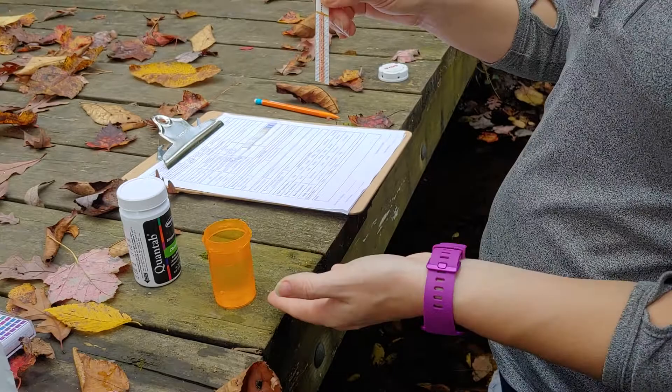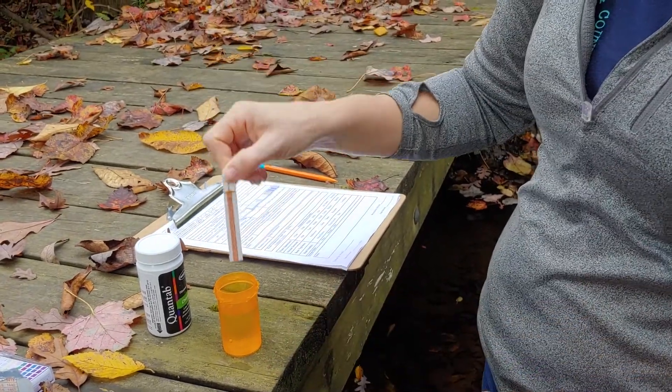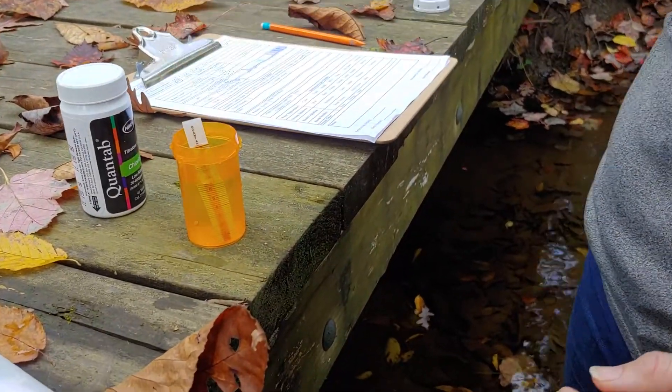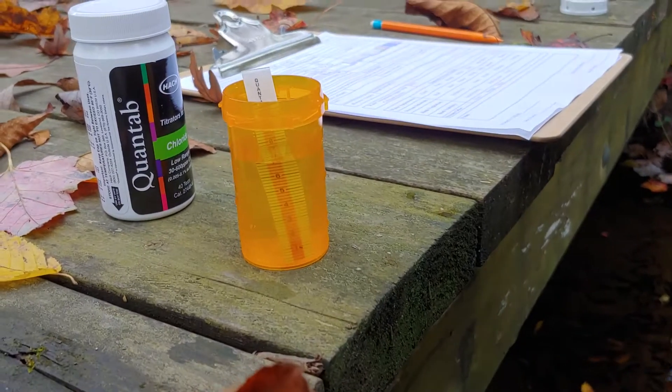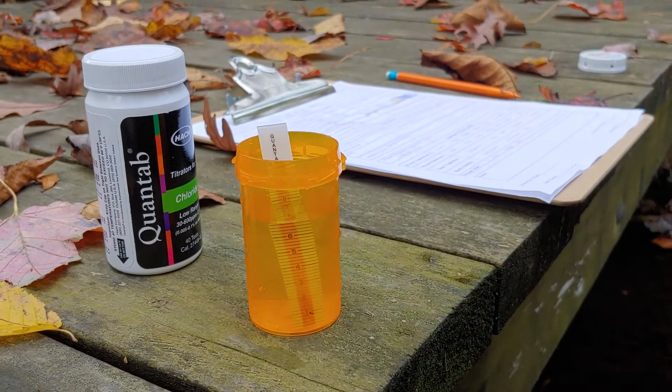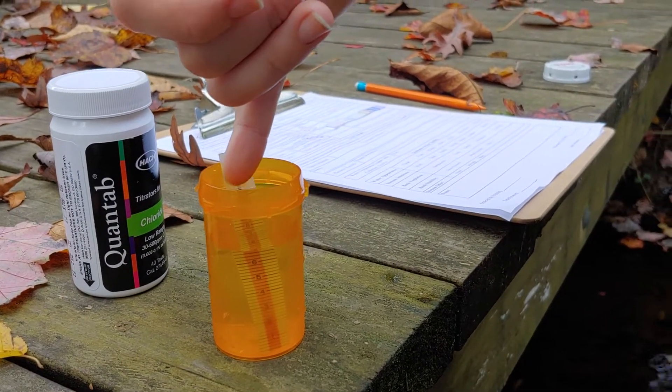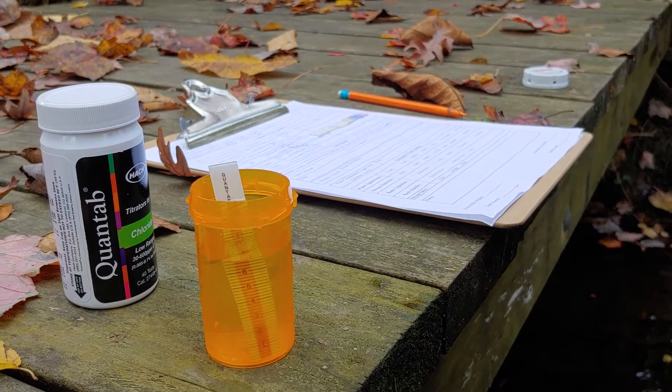So we've collected another sample of water and we're going to submerge our chloride strip for about 45 seconds to a minute until we see a change in color on our top indicator line.